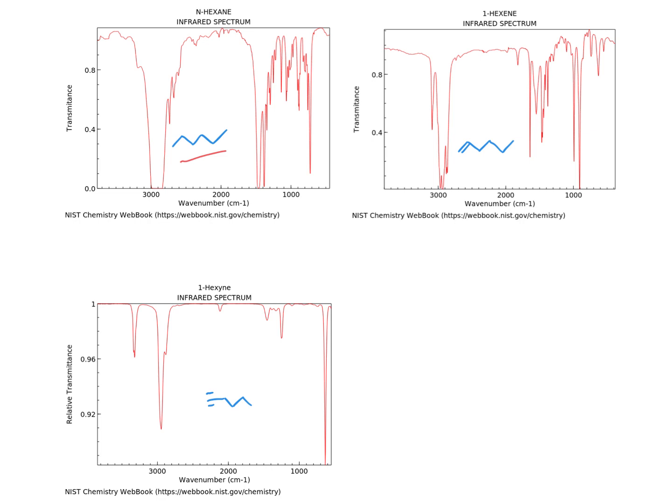So this is going down even beyond where it appears that the spectrum goes, which of course is not even possible, but it seems to happen. So what this is just showing is that we've got peaks right below 3,000, and that's about it. We see other stuff in the fingerprint region, but that's about it.